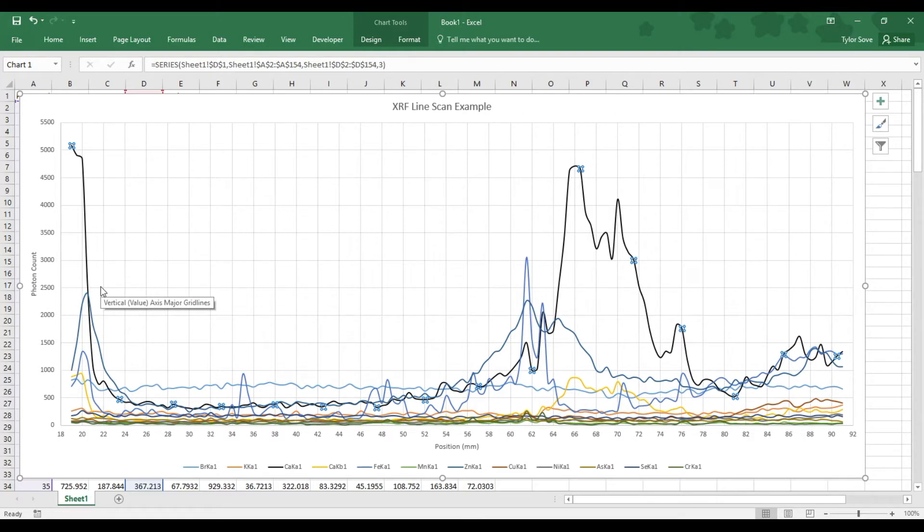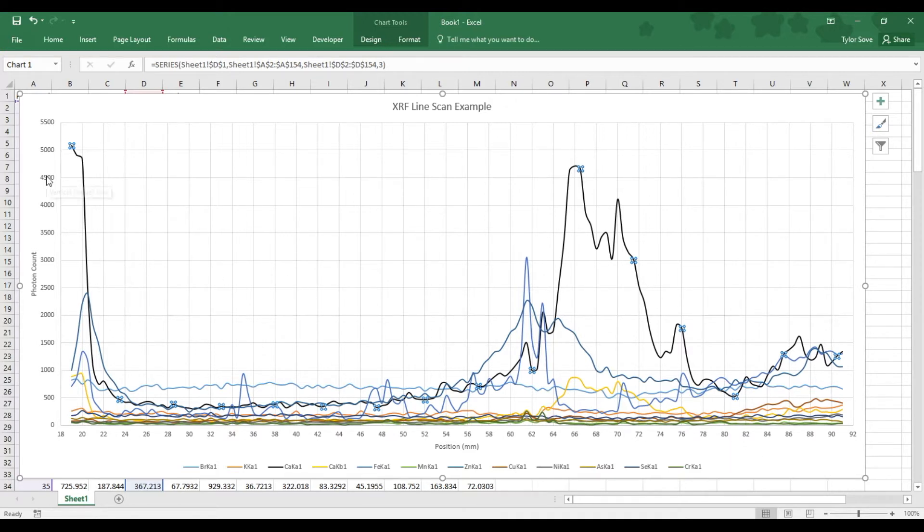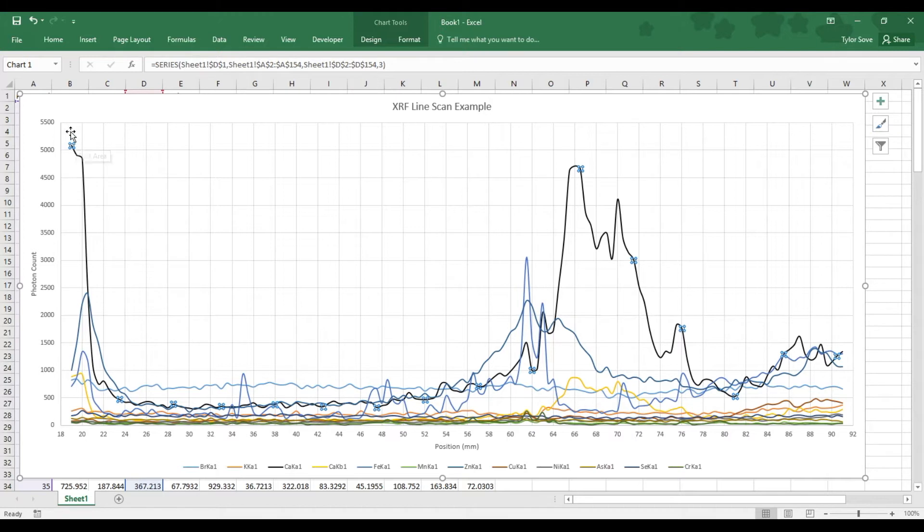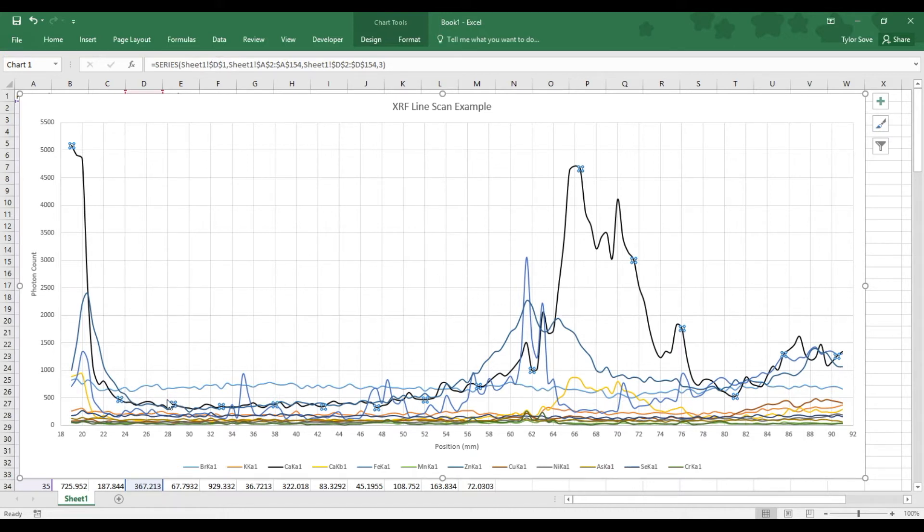For a specific element and how that changes throughout the scan, throughout the position of our sample, we can start at the far left and work our way right, watching how the height of the line changes. For the calcium K-alpha line, we can see it was initially abundant and then rather abruptly drops to a lower concentration. For the next 30 or so millimeters, it stagnates at roughly the same concentration, and towards the end, it slowly picks itself back up.